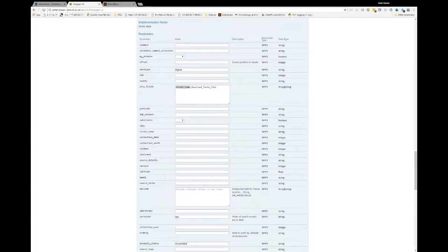Is there a controlled vocabulary reference, especially for metadata containing strain, collection, and source? So that's an interesting question.